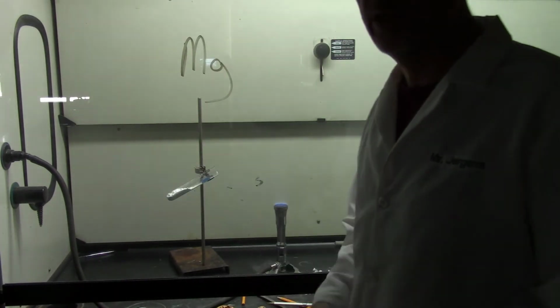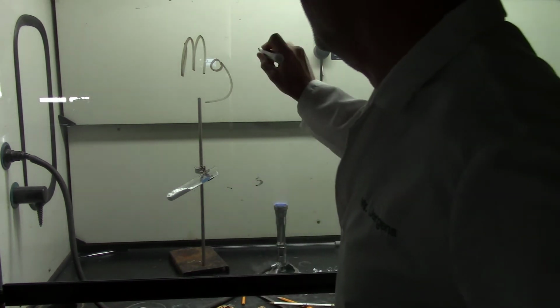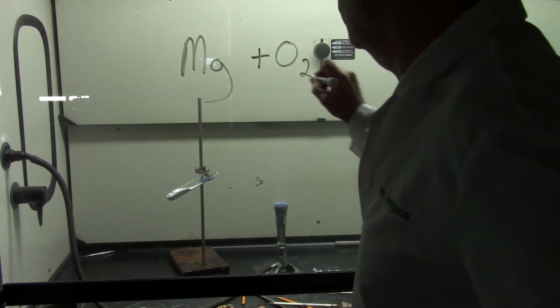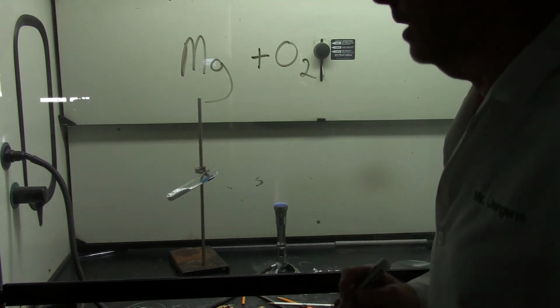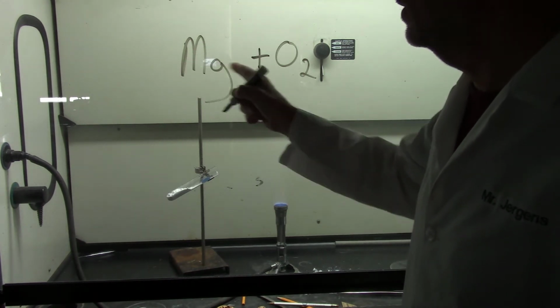All right, you stop burning. Boy, that sure looked like a combustion reaction, didn't it? But in chemistry, you would not say that that is a combustion reaction. A firefighter would say it is because it does require O2 to do its thing. In chemistry, we don't call it a combustion reaction because there's no carbon source here.